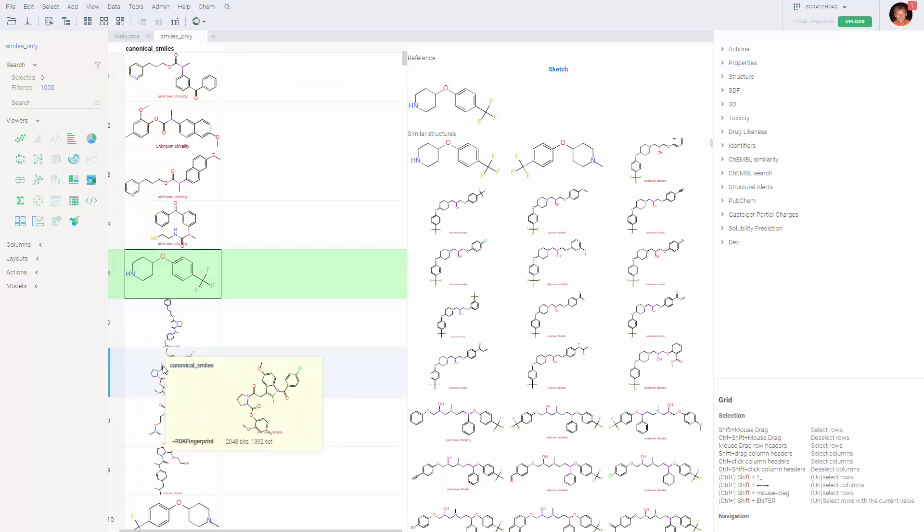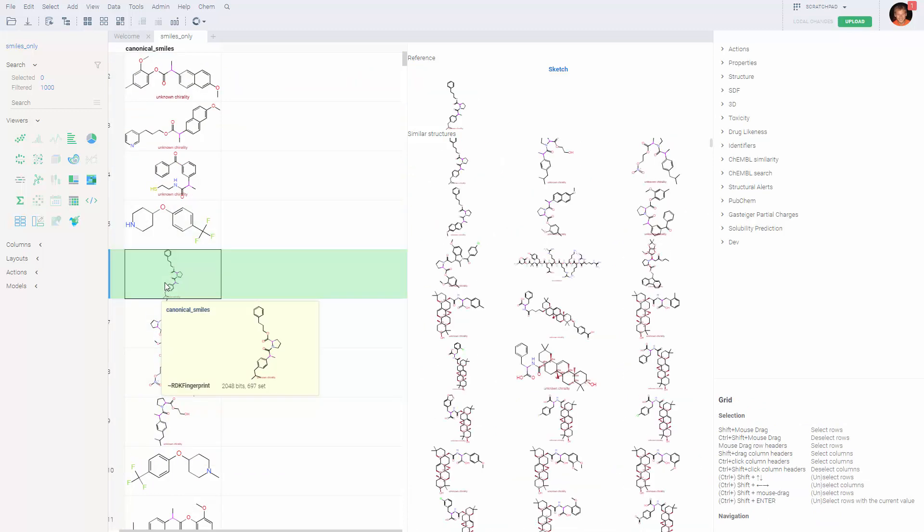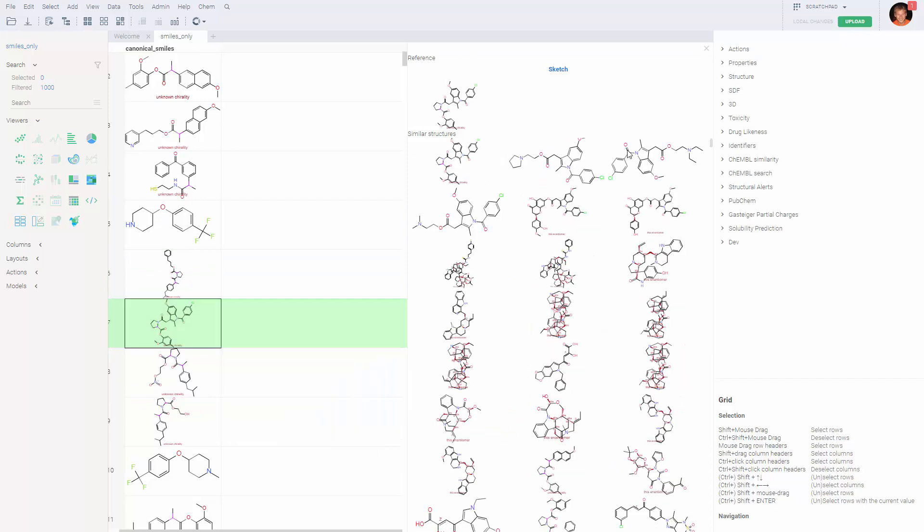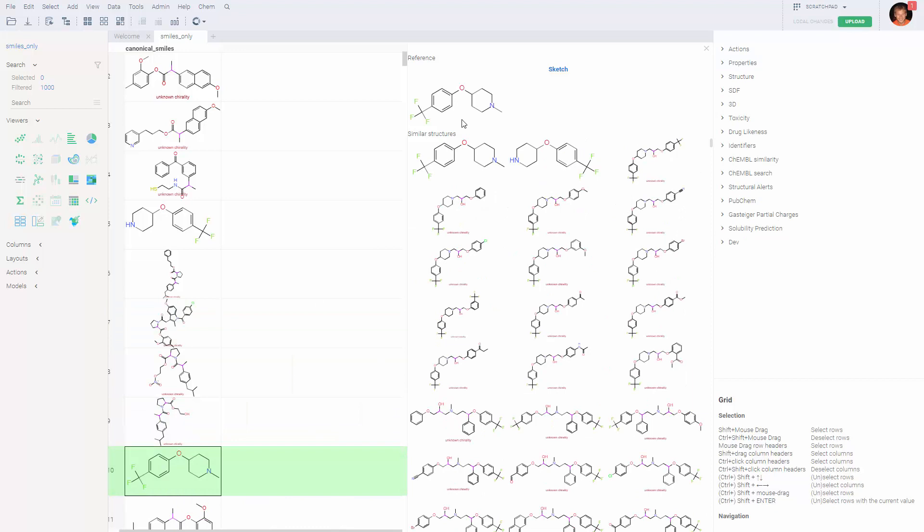To change the reference molecule, just click on a different cell and you'll see that these molecules are sort of similar to the reference one. For the similarity score, we use a metric that is based on the Tanimoto score against the specified fingerprints.